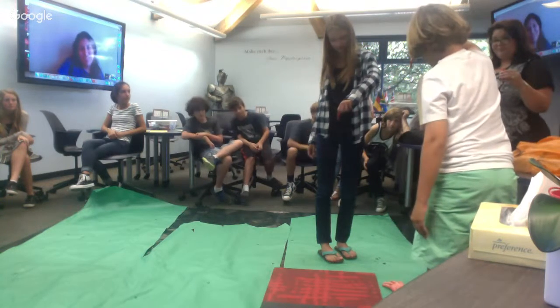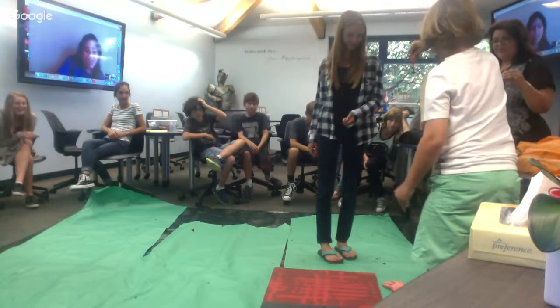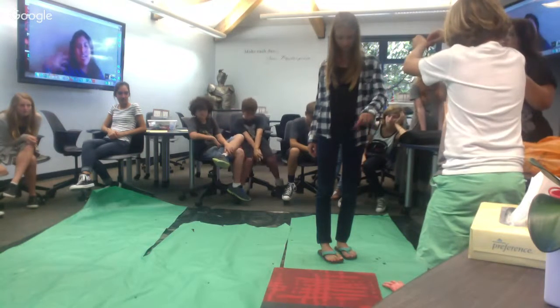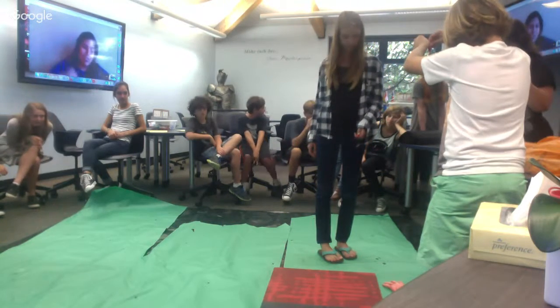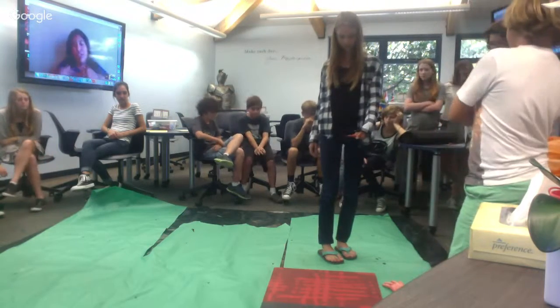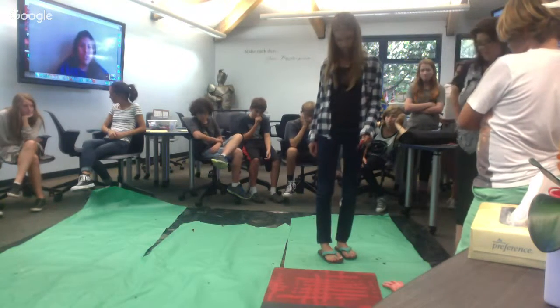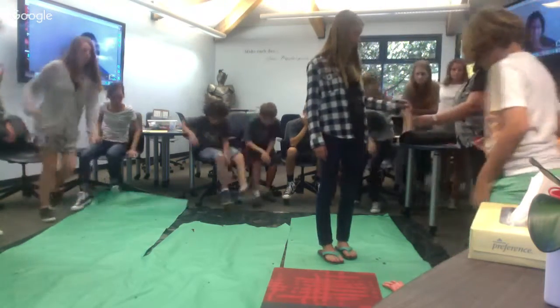That could also be from the fact that when it's actually hitting the carpet, one, it's absorbing it, and two, because of how it's falling, any accompanying drops that come after are going to be falling in, making a splash pattern. So each time it drops into the blood, it's splashing a little bit more out. But you guys want to see how it is? Can you see from the carpet to the material?